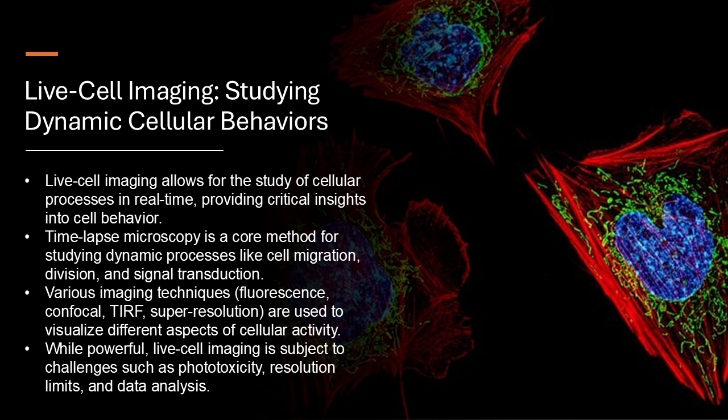Well, one area that I'm particularly fascinated by is the study of how cells interact in these complex tissues and organs. You see, so far a lot of the research has focused on these individual cells in isolation. But in reality, our bodies are made up of trillions of cells, all working together in this beautifully intricate way. So it's like we've been studying the individual pieces of a puzzle. But now we're finally starting to see how they all fit together to create the bigger picture. Exactly. And with live cell imaging, we can begin to understand these complex communication networks that govern tissue development, function, and repair. We can see how cells influence each other's behavior, how they cooperate to perform tasks, and how they respond to changes in their environment. It's like we're moving from a solo performance to a grand symphony, where each cell plays its part in creating this harmonious whole. A perfect analogy.